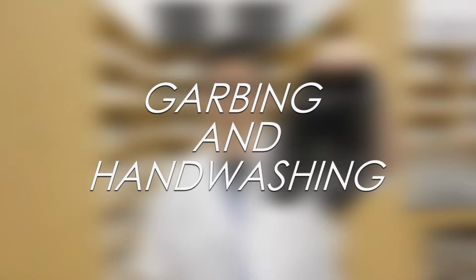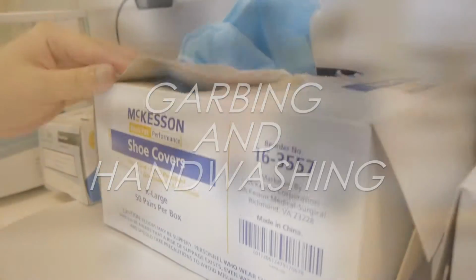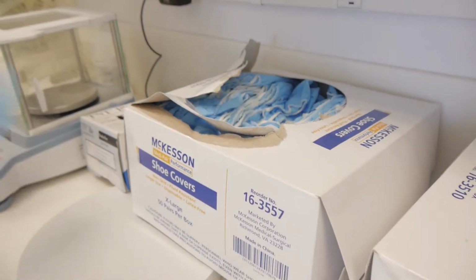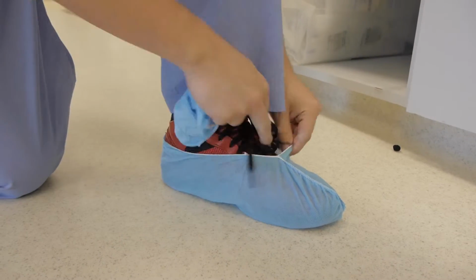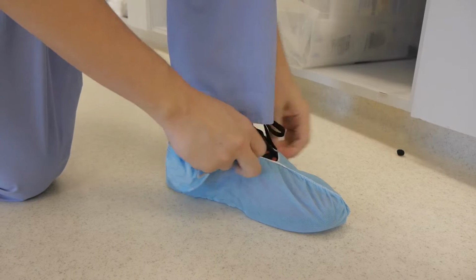Always start with the dirtiest areas first. Your shoes. When putting on the shoe covers, make sure you cover the entire shoe, including the laces. As a reminder, you should always wear closed-toe shoes in the clean room.